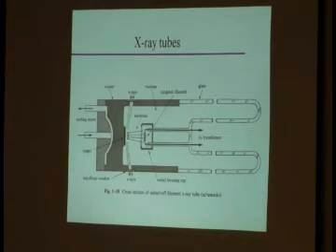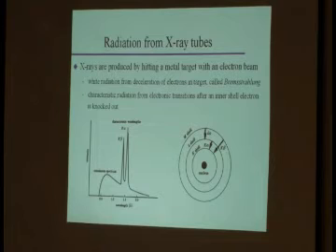Now, let's look in a little more detail at what determines what the wavelength of these X-rays is. Here's a little picture, okay? So, we hit the metal target with a high energy electron beam. 2 things happen, okay? One is the electrons that hit the target are decelerated. It's pretty logical, right? When the electron is decelerated, it loses energy, so we need to get rid of that energy somehow. And that is the white background of a lab X-ray tube. Okay? It's called Bremsstrahlung, which is the German word for braking radiation.